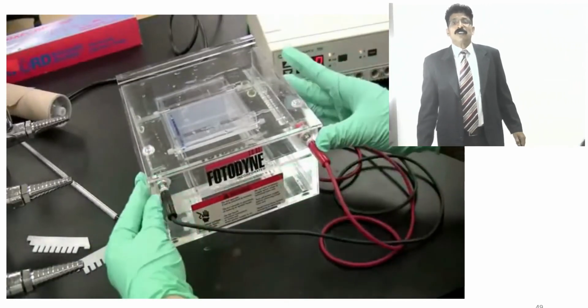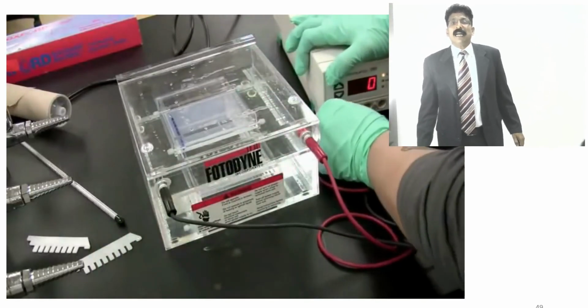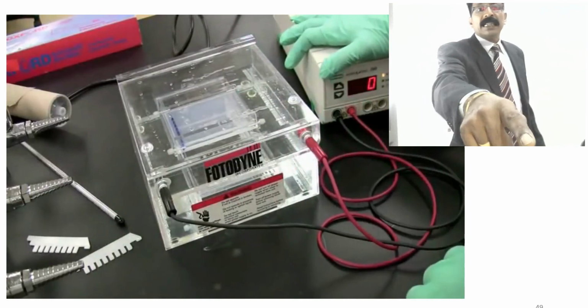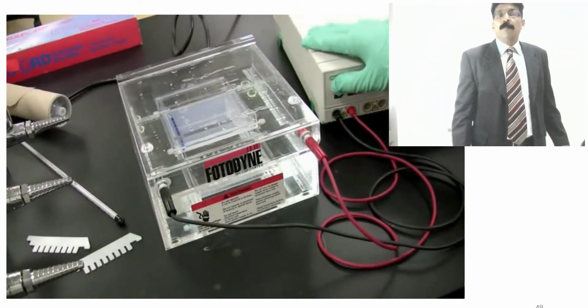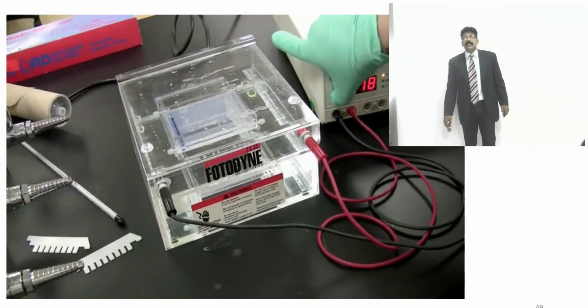and then she is closing the electrophoresis unit, and also she is putting the two electrodes, that is black and red. The black is negative and the red is positive, and giving 100 volts. 100 volts current is given, and it will be given for 30 minutes.